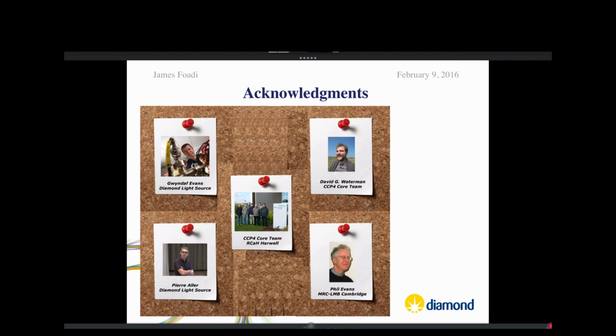To finish, I have written most of the Blend code, but main ideas and lots of help has also come from the following scientists. Gwyndaf Evans is Blend's principal investigator. He is also principal beamline scientist of the VMX-M beamline, currently under construction at Diamond, and group leader of the East branch of DIALS, the novel software for X-ray data integration.